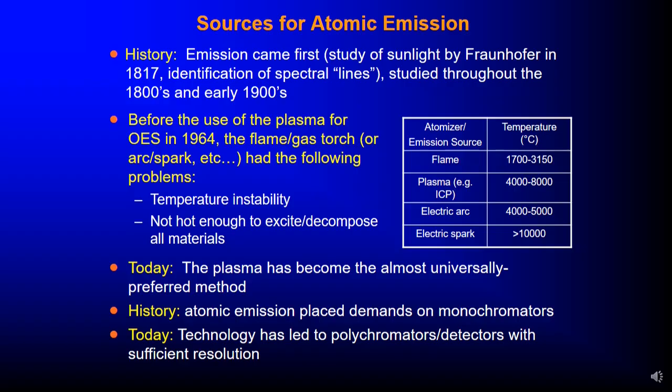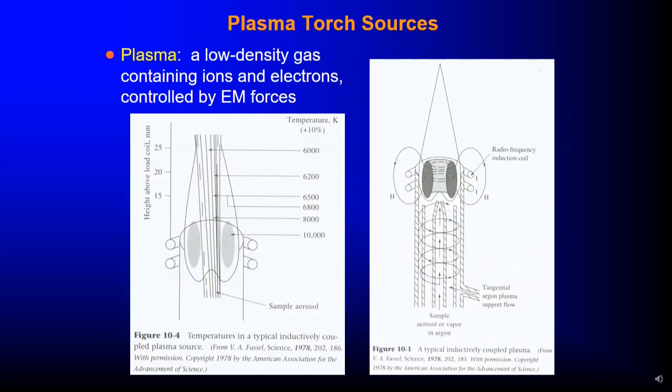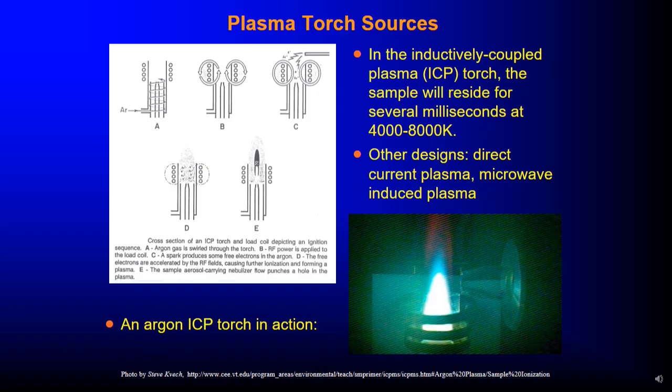Then you can still see an argon ICP torch in action, how atomization is done.